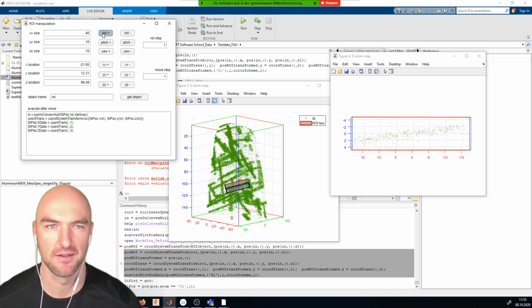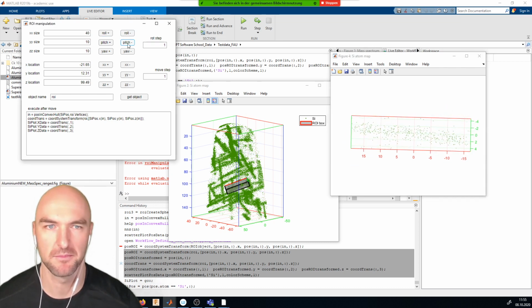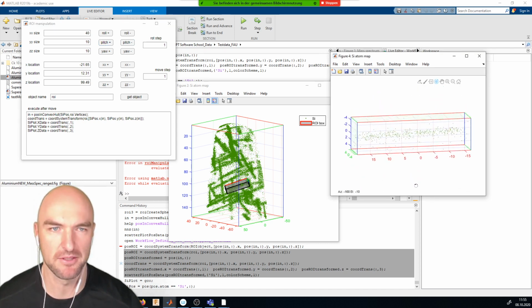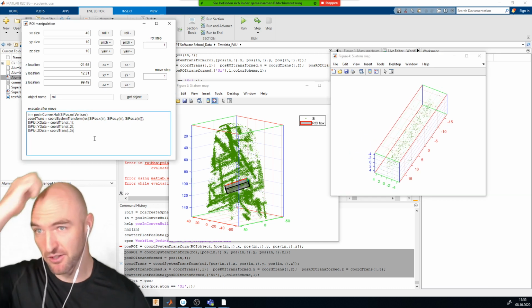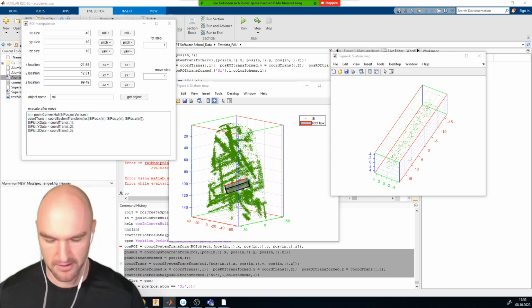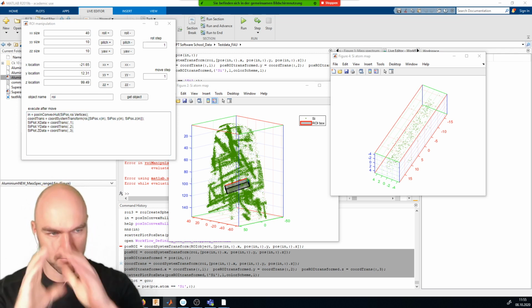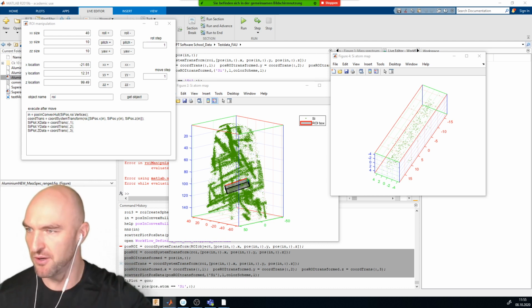Oh, that was the wrong transform, so this is probably then pitching it. And now we have our little precipitate properly aligned. And I think you can all imagine that it's also relatively simple to do that with some sub-volume of the data set if you want to rotate it around.